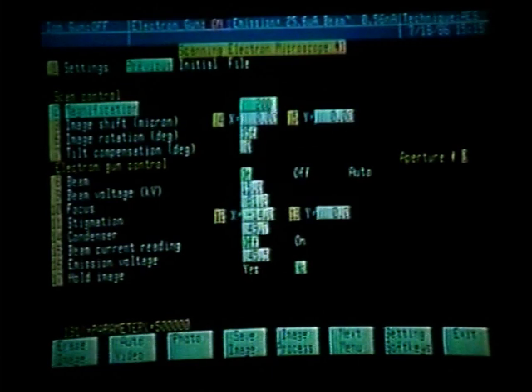Before we actually acquire the photo, we should at this point activate the auto video by pressing soft key number 2. This will once again give us the optimum multiplier voltage, contrast, and brightness, which will then give us the best SEM image.